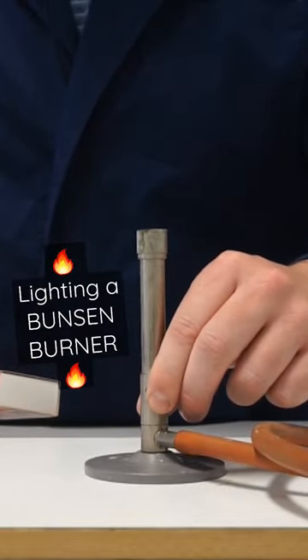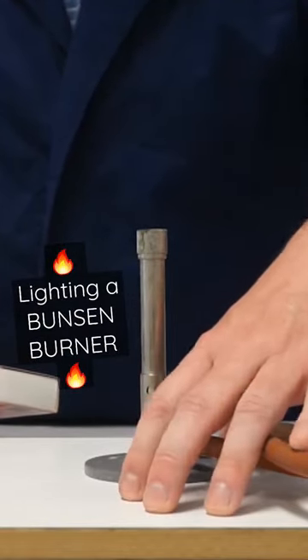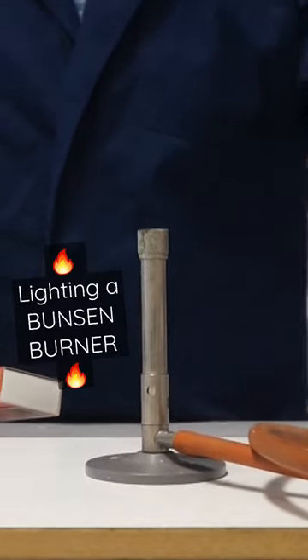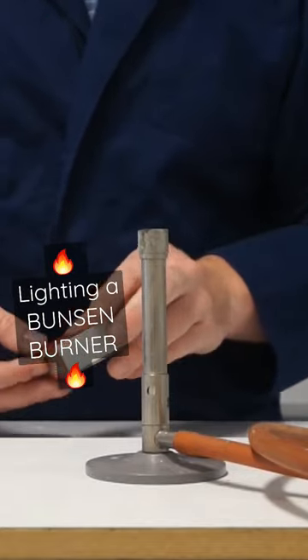I've checked that my air hole is closed, it's on a heatproof mat, and my gas hose is securely fastened to our gas tap, and the gas is turned off. I'm now ready to light the Bunsen burner.